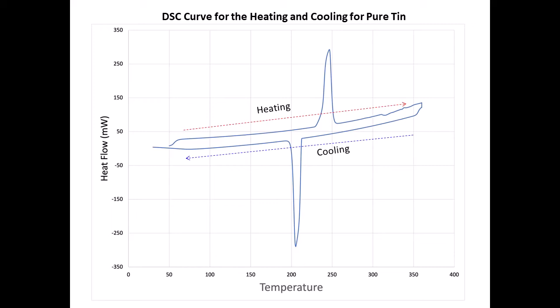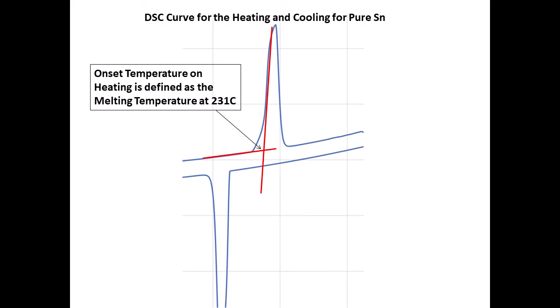This is demonstrated here by the fact that while the tin melts at its melting temperature on the heating side, we are able to achieve some degree of undercooling, meaning that we make the liquid remain liquid to a temperature below its melting temperature. In the cooling curve, the transformation temperature is suppressed relative to the melting temperature on the heating side.